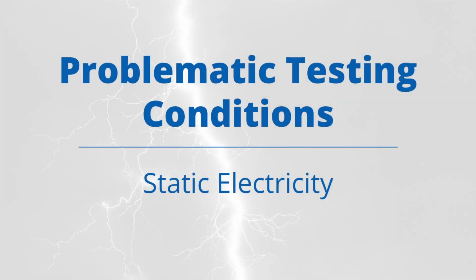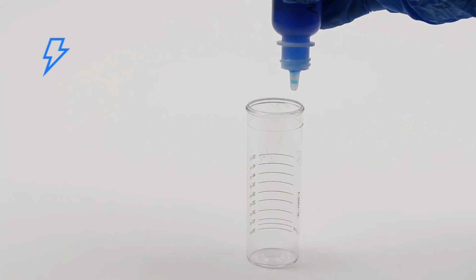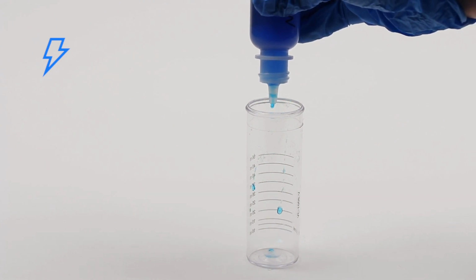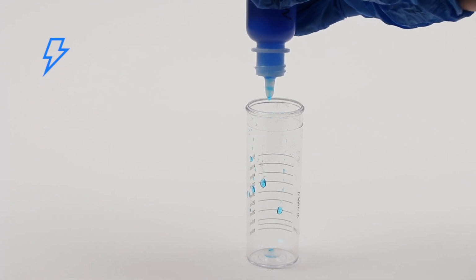When performing drop count tests, it is important to minimize interferences that may affect your results. In this demonstration, we will illustrate the effect of static charge. First, we will add drops to a plastic vial in an environment where we have introduced a static charge. Notice how the drops are pulled to the side of the vial and are irregularly shaped.